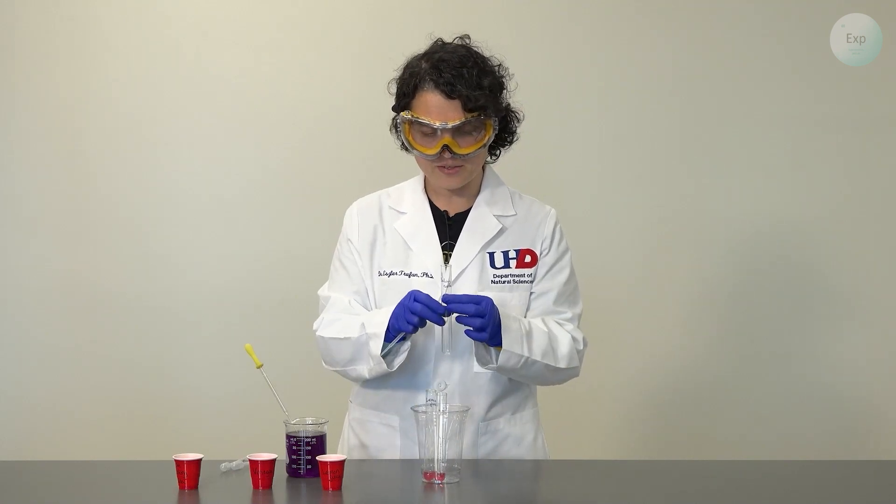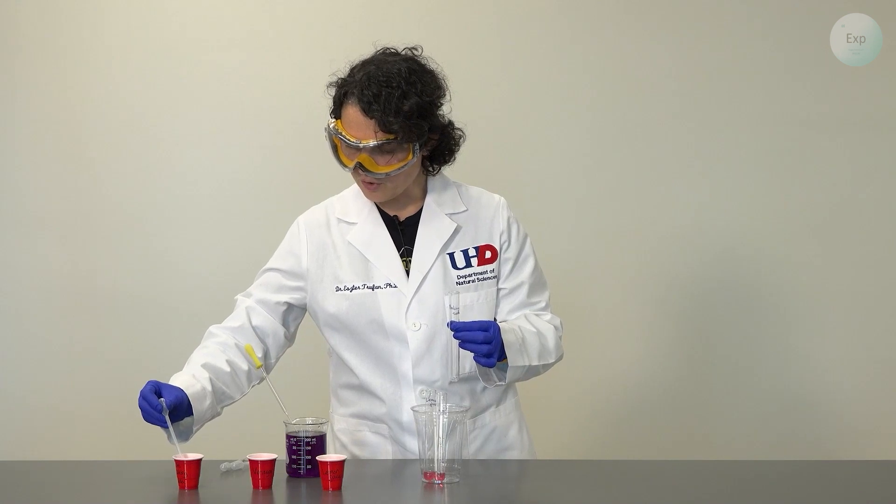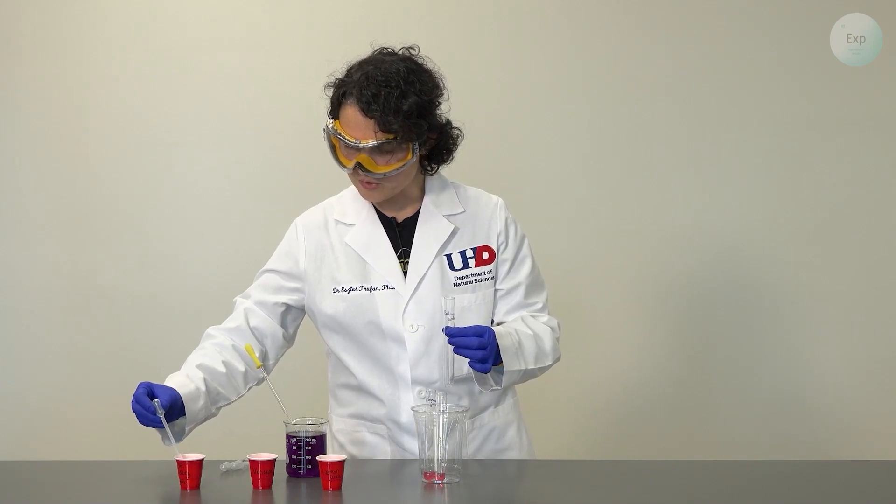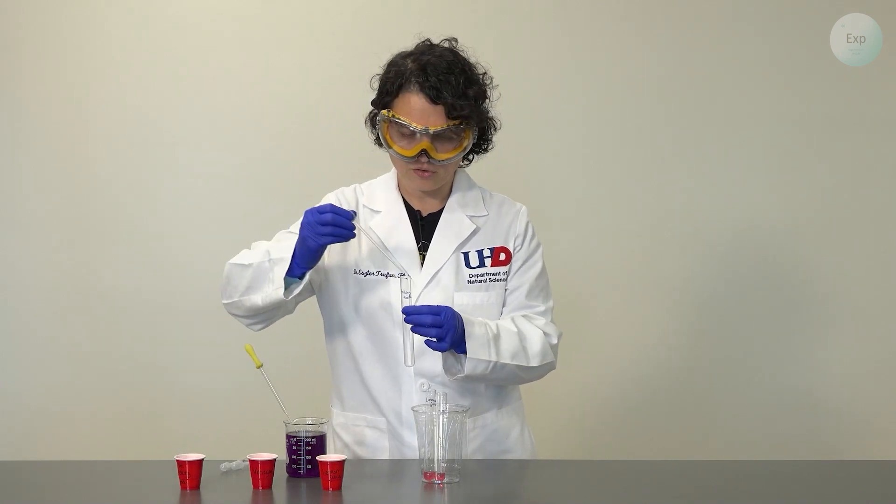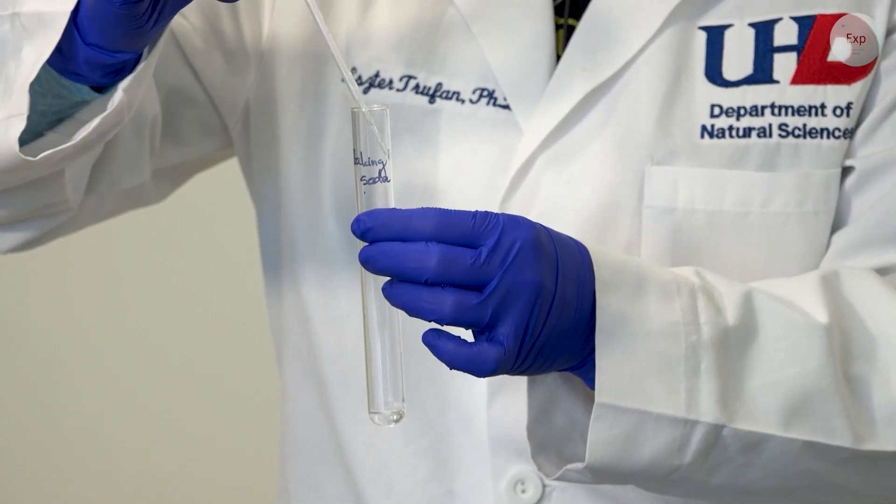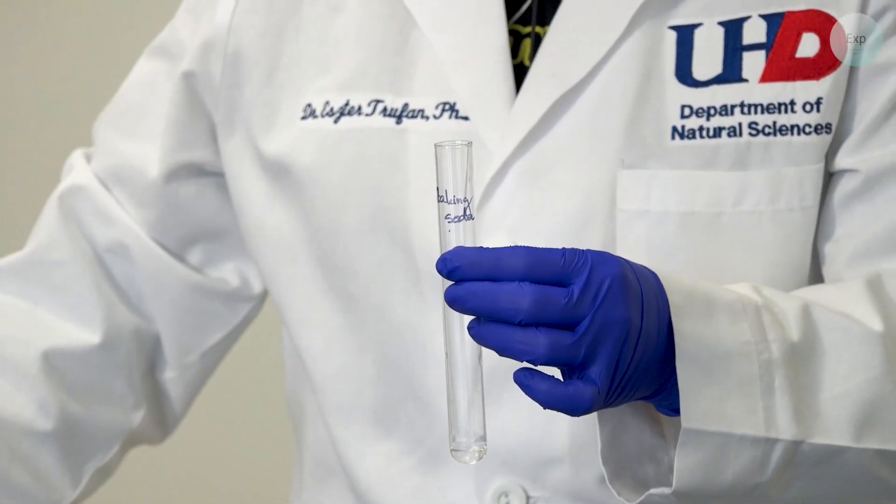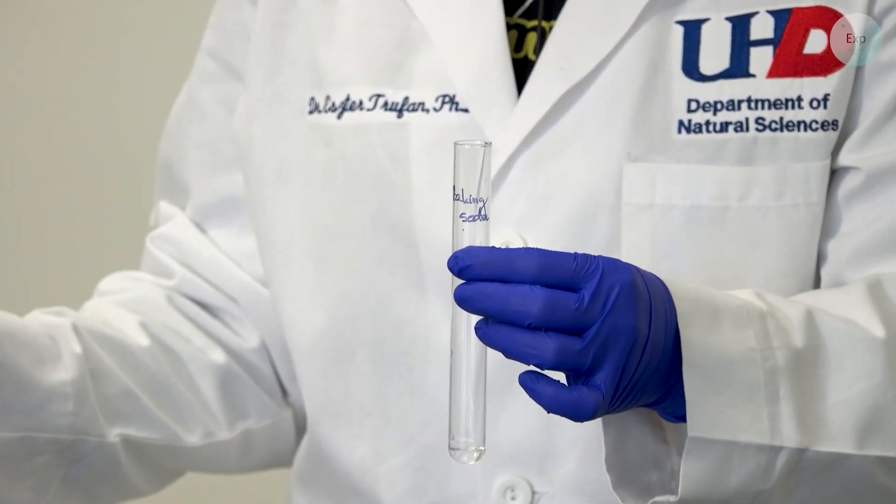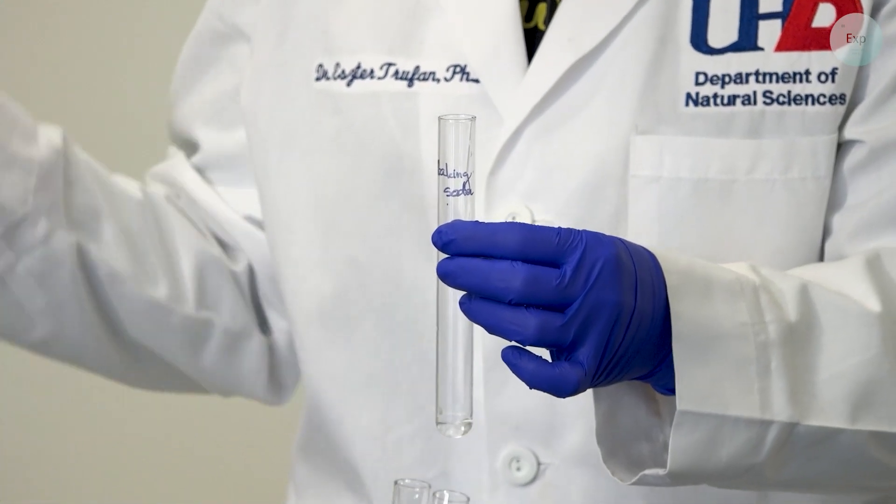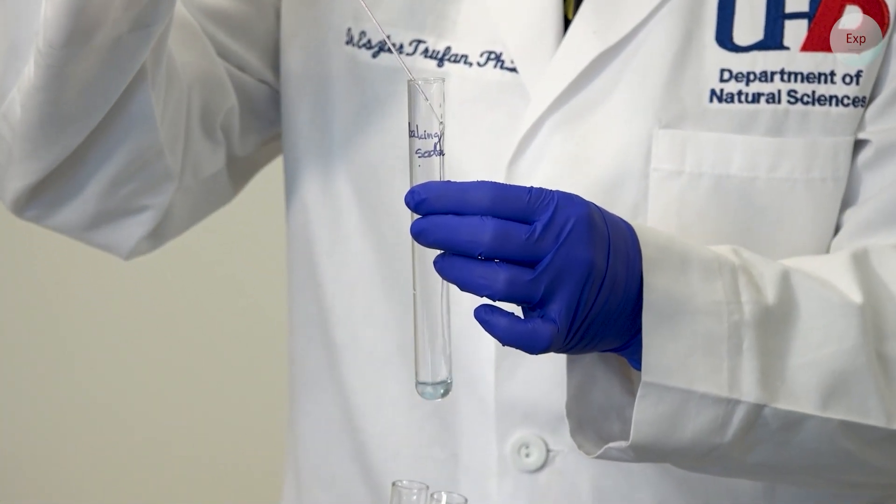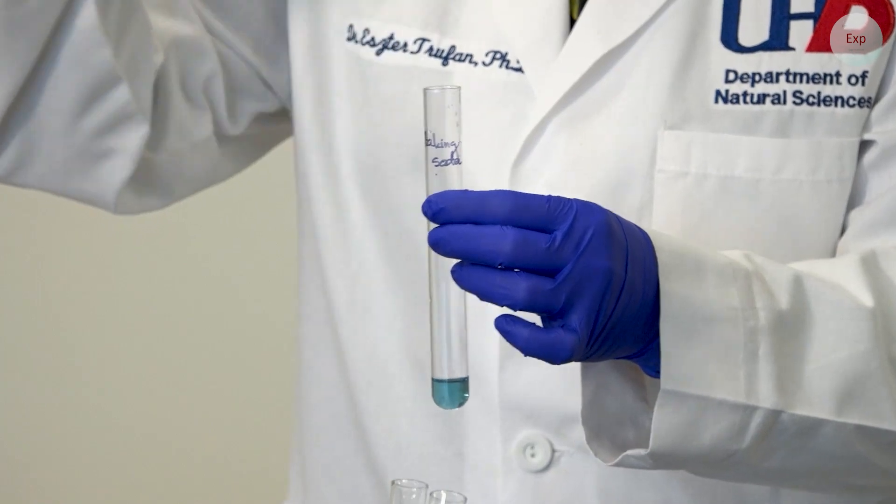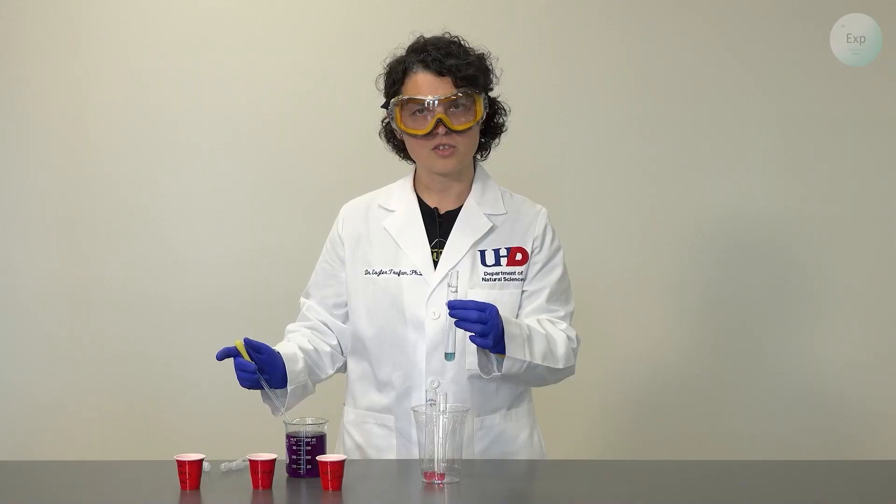Finally, I am going to test the baking soda solution. I will draw up some of my saturated baking soda in my pipette, transfer it to the test tube, and then transfer the indicator solution into it. And it changed color yet again.